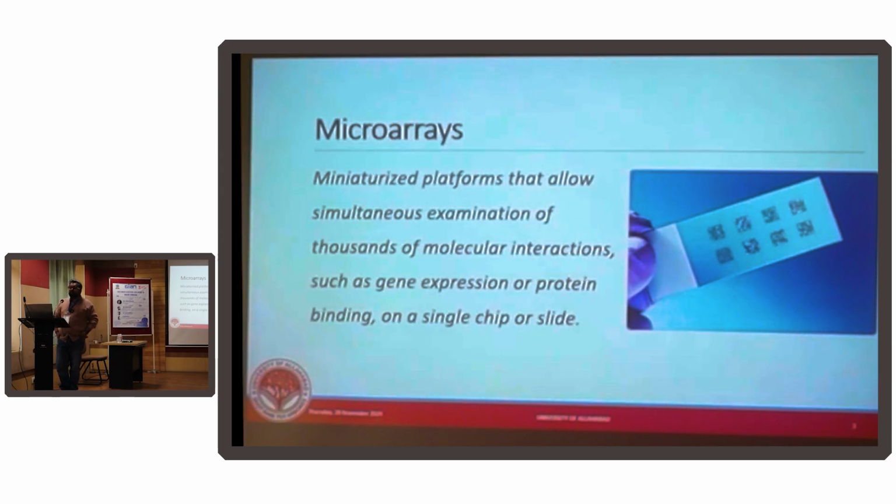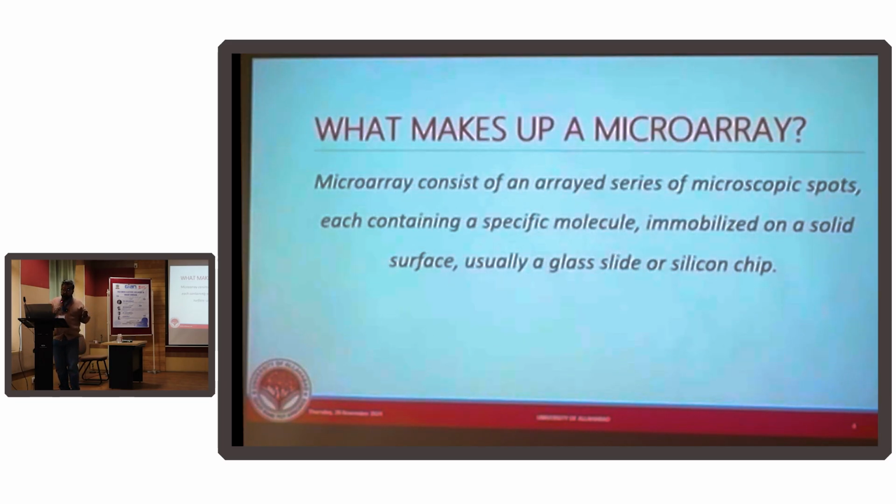And what you can do, you can do it on a very small, I think all of you have seen a microscope slide, right? And it's very small. It's very handy. You can carry it with a hand. That makes microarray something which is extremely portable. You can take it in your pocket, and the work that you need to do can be done very fast.